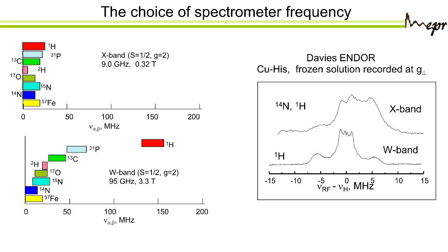Here, and the bottom one, the scale was plotted as the RF frequency minus the proton Larmor frequency. And then you see it's really nice. We see the protons, the nitrogen are somewhere very far away. And you can identify these two shoulders at the end with a coupling of about 11 megahertz. And then you see all these different singularities.